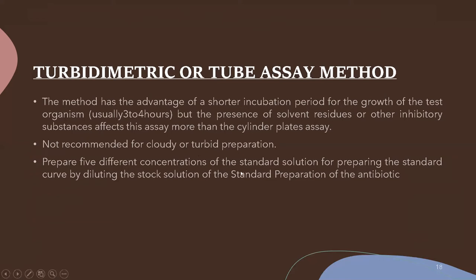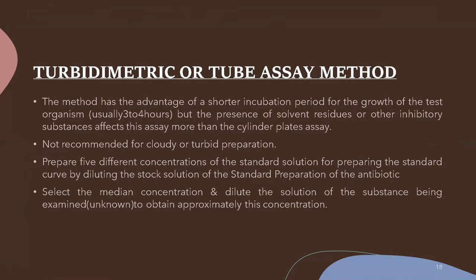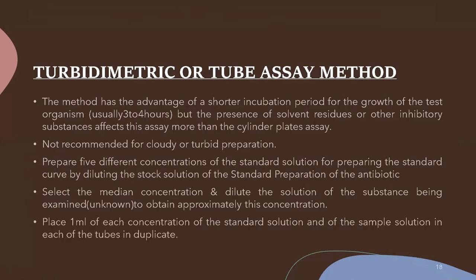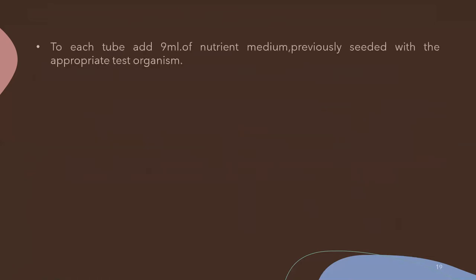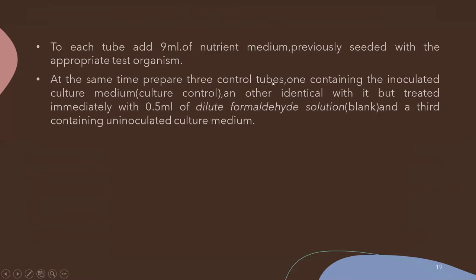For the turbidimetric method, prepare five different concentrations of the standard solution by diluting from the stock solution. Select the median concentration and prepare the unknown solution considering the median concentration. Then place 1 ml of each standard solution and test solution into test tubes. Add 9 ml of nutrient medium previously seeded with the test microorganism into each test tube. Prepare three control tubes: one with uninoculated culture medium, one with inoculated culture medium as a culture control, and a third with inoculated culture medium plus 0.5 ml of dilute formaldehyde solution as a blank.